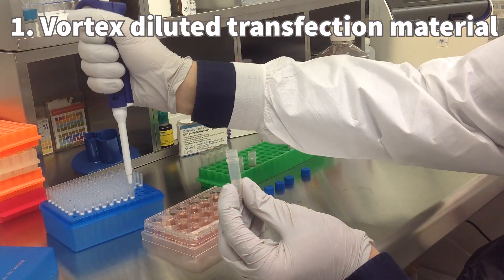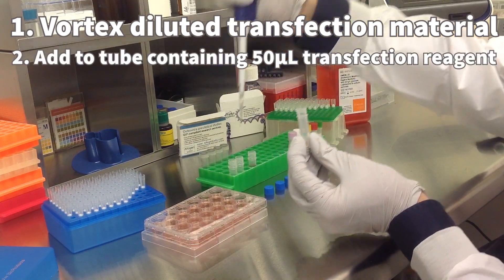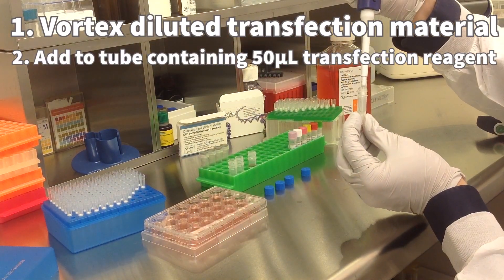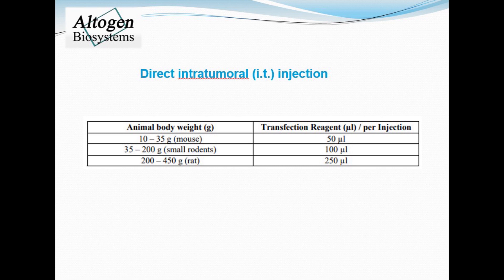Make sure to vortex the diluted transfection material before adding to a sterile tube with transfection reagent. For tail vein IV use 50 microliters of transfection reagent, and for intratumoral administration use the provided chart to determine the optimal volume.